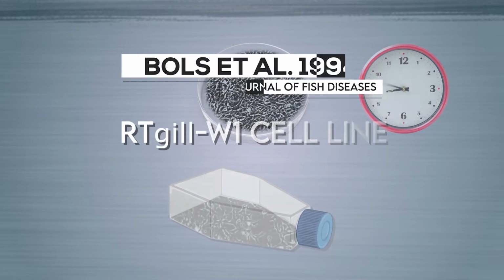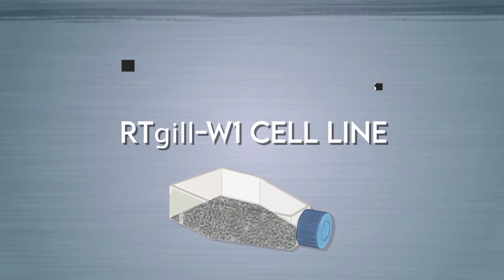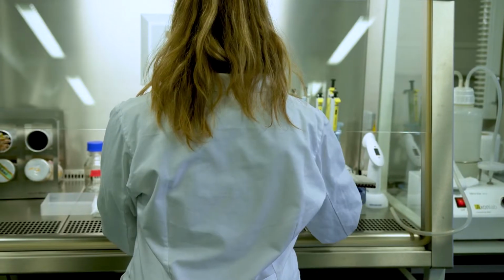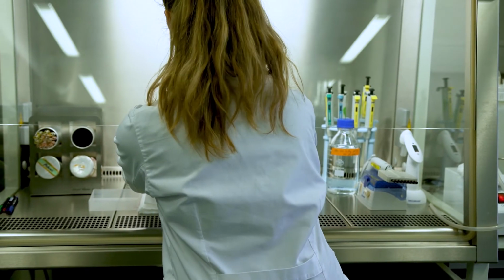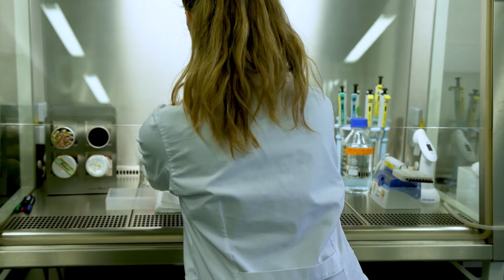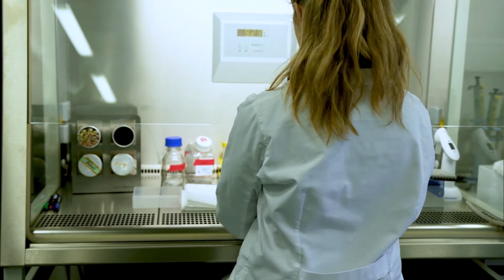And with time, cells grew out of these tissue pieces. And so he nurtured them further. And after some time, the entire cell culture surface was covered with new cells, which he could lift off and put into 2 new culture plates. And so you can imagine that in this way, you can continuously, permanently culture these cells. And we are still using them in exactly this way today.